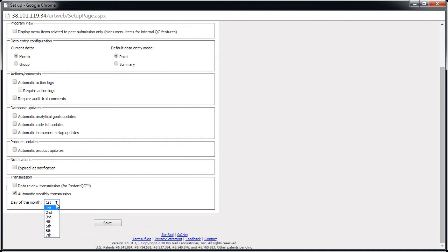Note that your data must be entered or imported into the software prior to the date you select. Click Save.